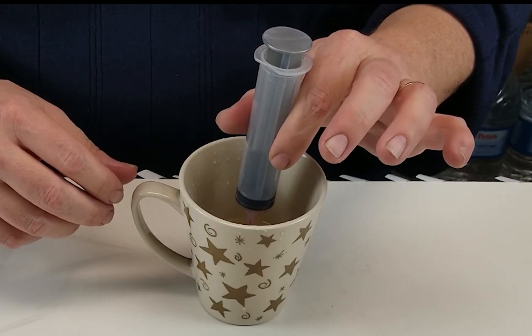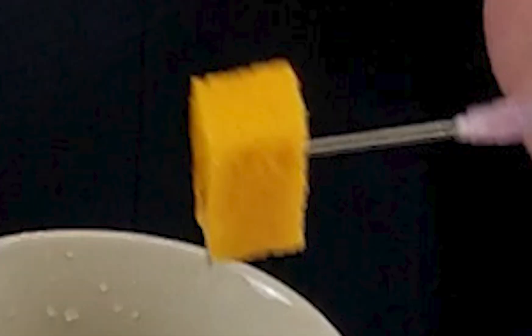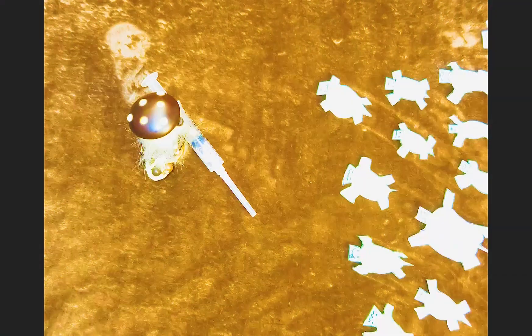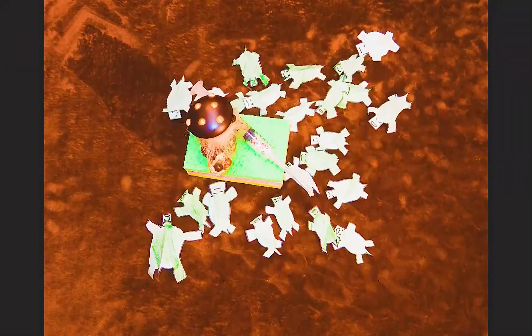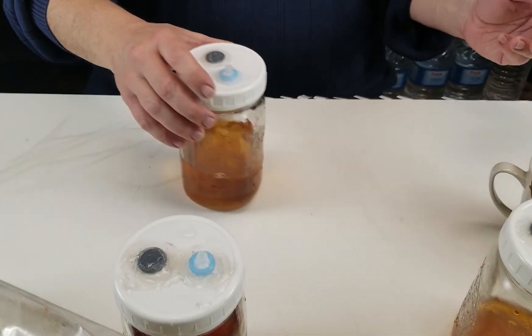Now we're going to stab our little bit of sponge there and pick it up for use, and we'll proceed. So what does that sponge actually do for us? It doesn't kill any fungus, it doesn't kill any molds — all it does is help to keep them away. Without it, our injections would be overrun by the ambient mold on the surface of the bag or the air around it, and everything we do would be ruined by a single spore. But with that sponge in place, it actually provides a protective barrier where you can withdraw your needle before and after injections, keeping it completely clean and free from contaminants as long as your alcohol remains clean.